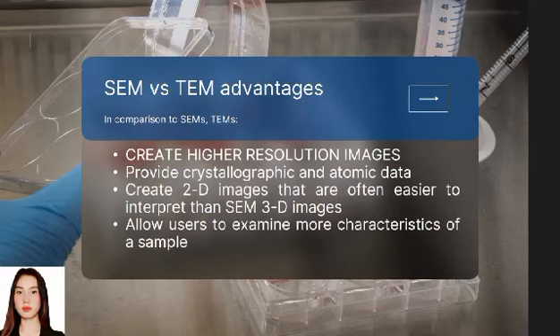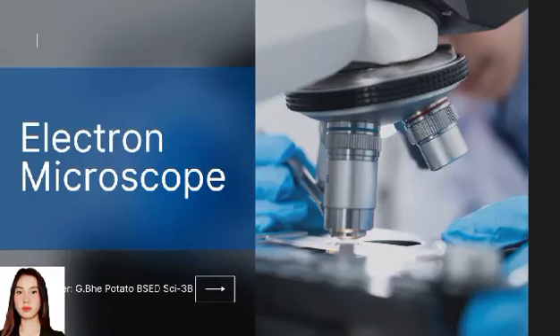of a sample. So for the summary of this lesson, electron microscopes are commonly used in fields such as biology, material science, and nanotechnology to study the fine structure and properties of materials and biological samples at the nanoscale. With their high magnification and resolution capabilities, electron microscopes have been instrumental in advancing our understanding of the molecular and cellular basis of life, and have contributed significantly to the development of new materials and technologies.